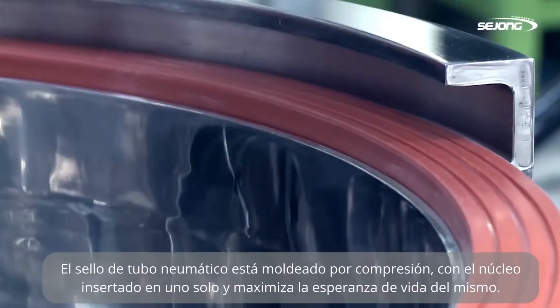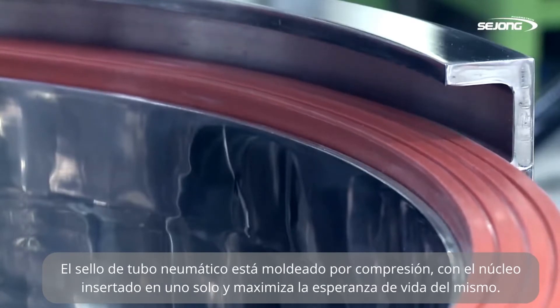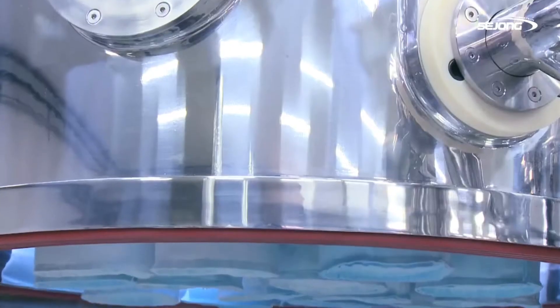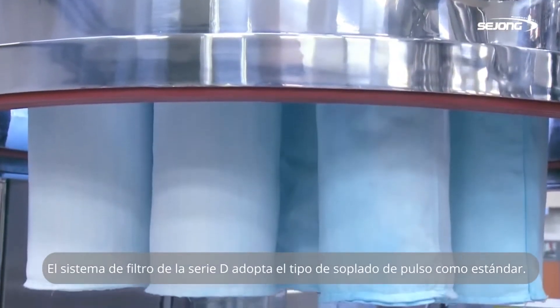The pneumatic tube seal is compressive-molded with the inserted core in one piece, which maximizes its life expectancy. The filter system of D-Series adopts pulse blowback type as the standard.